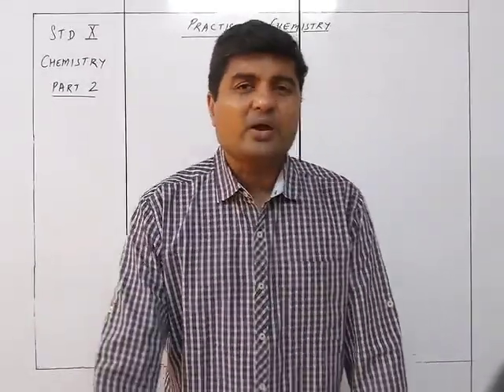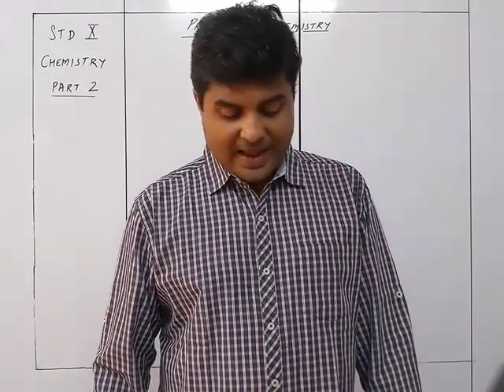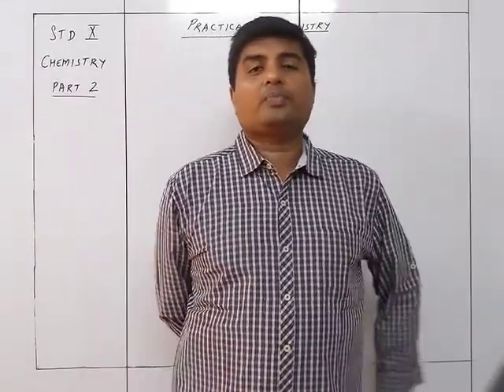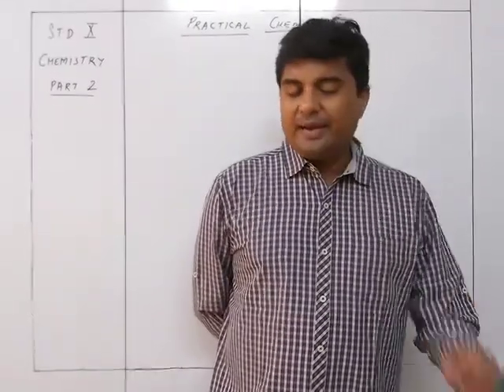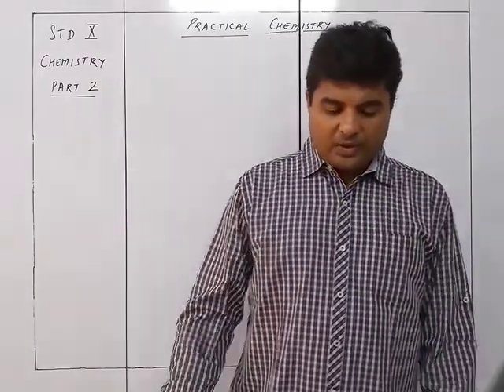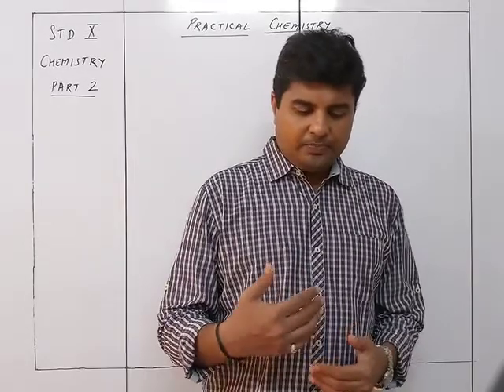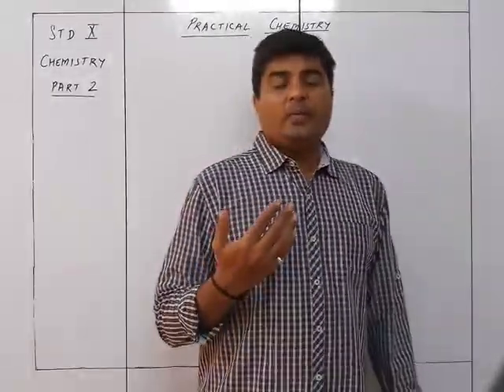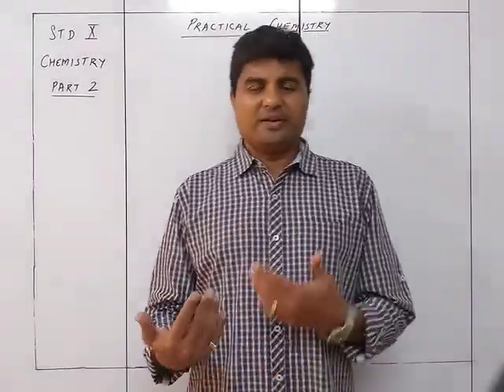The first thing we are going to take is Fe2+, iron 2. Whenever iron 2 reacts with NaOH, it gives me a dirty green precipitate. You can see over here that the equations are given in another table. The reaction and color change are given in the first part, because whenever you are asked for an observation, you need not write the equation. That's why they have written it separately.